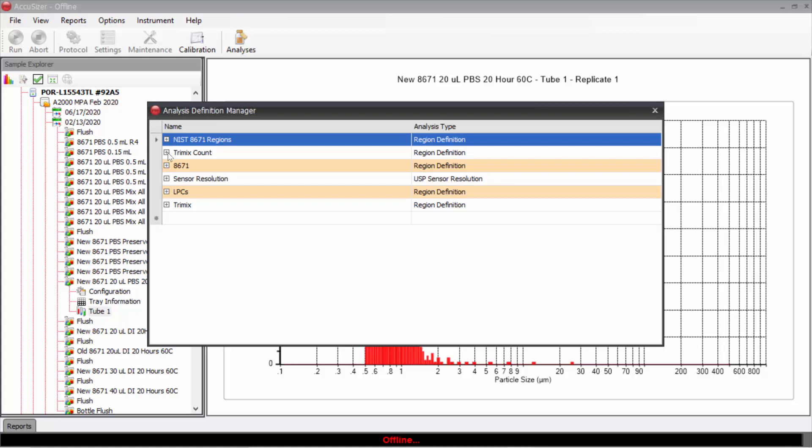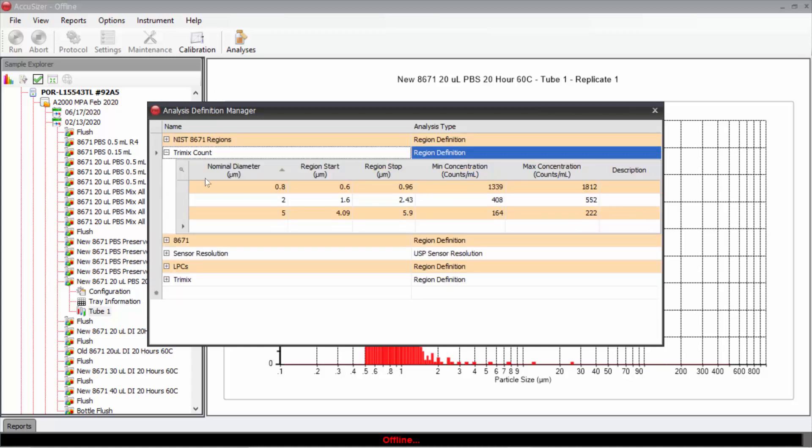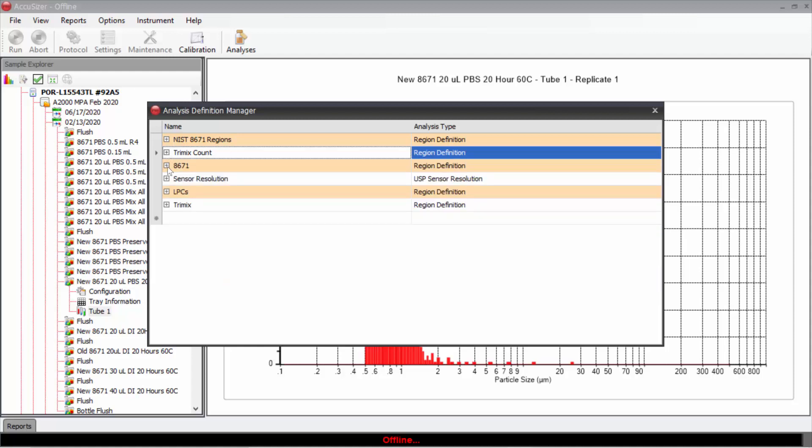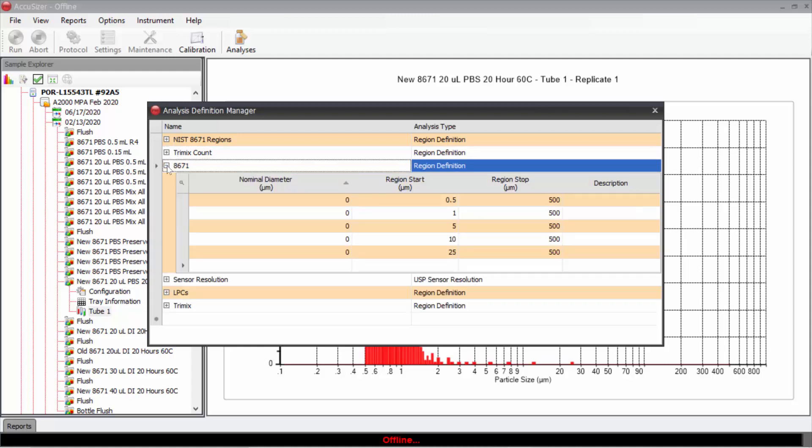For instance, for a TriMix standard, you'll see I've created a group of regions centered around 0.8, 2, and 5 microns, and here I put the minimum and maximum concentration. In other ones, such as 8671, I'm just saying let's measure from 0.5 to 500, 1 to 500, etc.